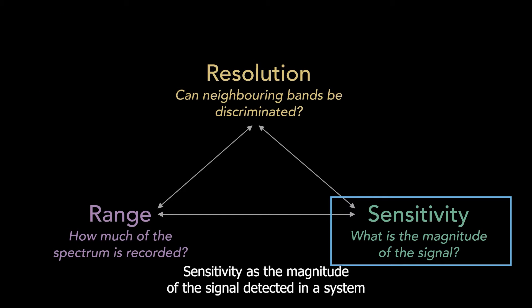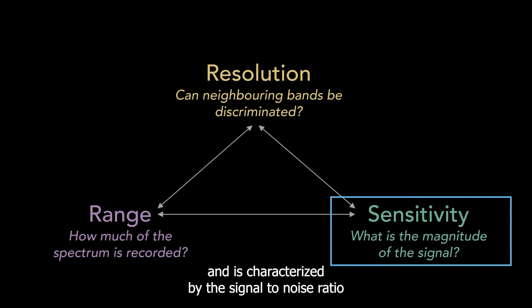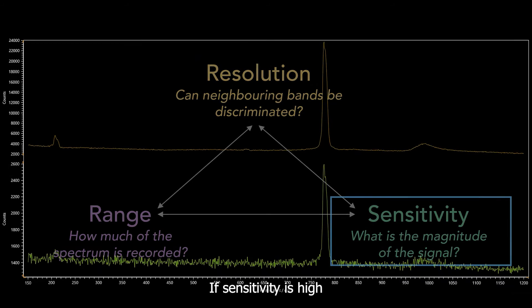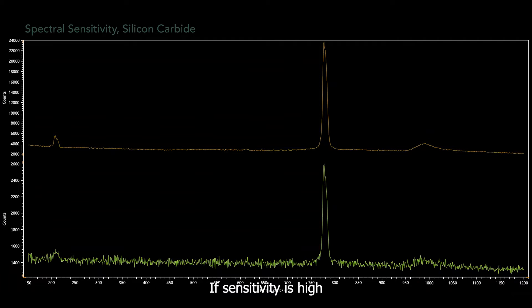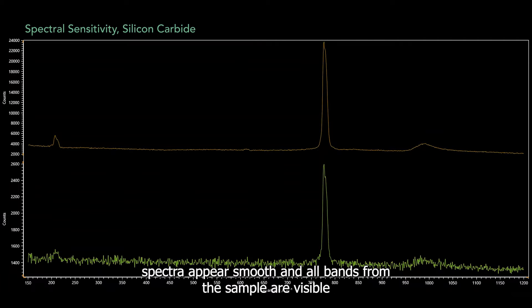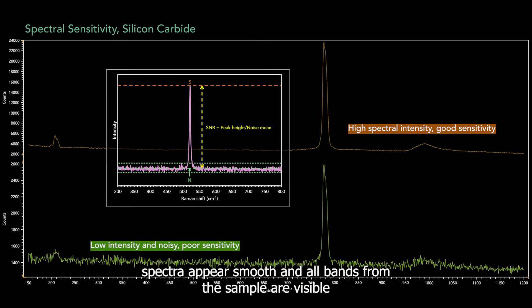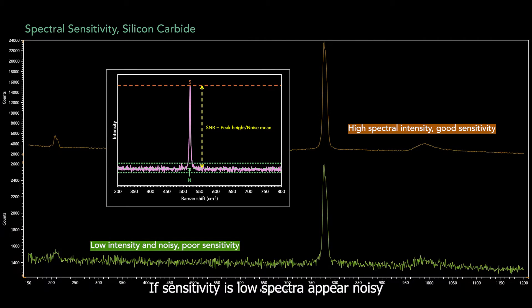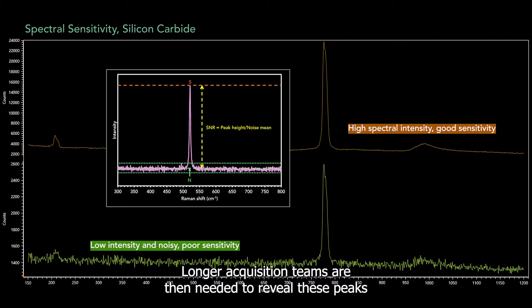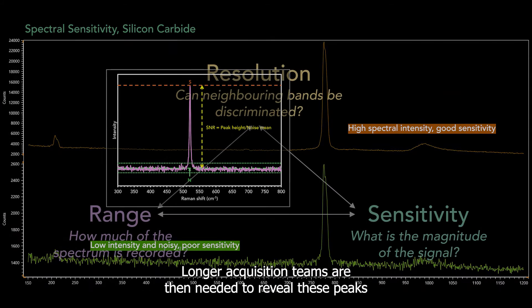Sensitivity is the magnitude of the signal detected in a system and is characterized by the signal-to-noise ratio. If sensitivity is high, spectra appear smooth and all bands from the sample are visible. If sensitivity is low, spectra appear noisy and expected peaks may not be visible. Longer acquisition times are then needed to reveal these peaks.